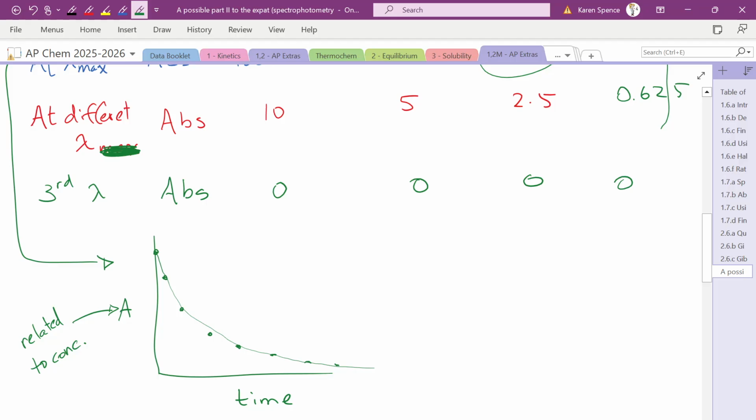And you can do, yes. Absorbance doesn't have units. So if you were doing a calculation where you just didn't want to bother converting your absorbance into concentration by doing a bunch of math, you could do a reaction rate. If you were just doing it for comparative purposes, this reaction rate with that reaction rate, you could just do it in absorbance and you would have no unit over time. But most of the time, what you will do is find the absorbance that relates to the particular concentration, and then use that to convert your absorbances into concentrations.